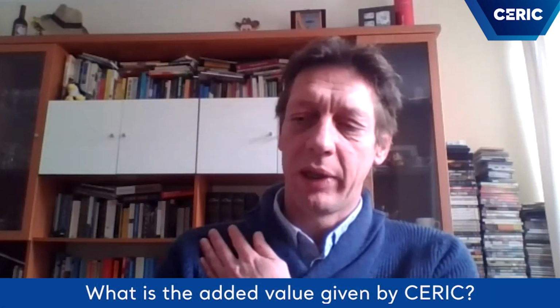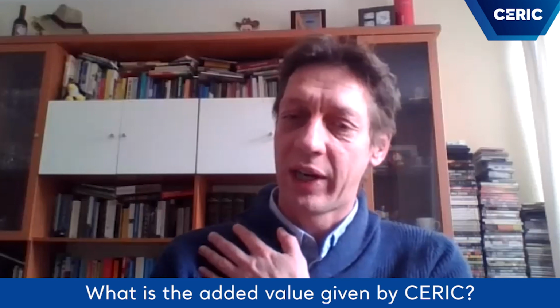It's quite clear to me because powder diffraction alone is usually not enough, and not anymore, to write an article. You maybe get a very small article about the structure of some new compound, but usually it's a part of a bigger picture. And the bigger picture, obviously, you can get to through CERIC, because very often, like for example with the batteries, you need several techniques to see what's actually happening inside.